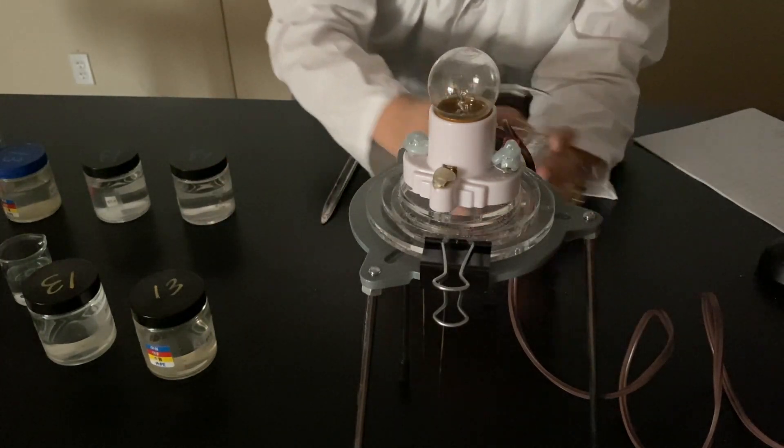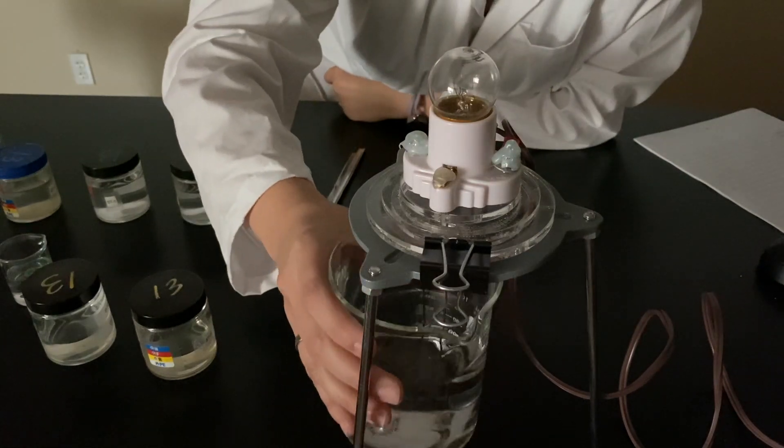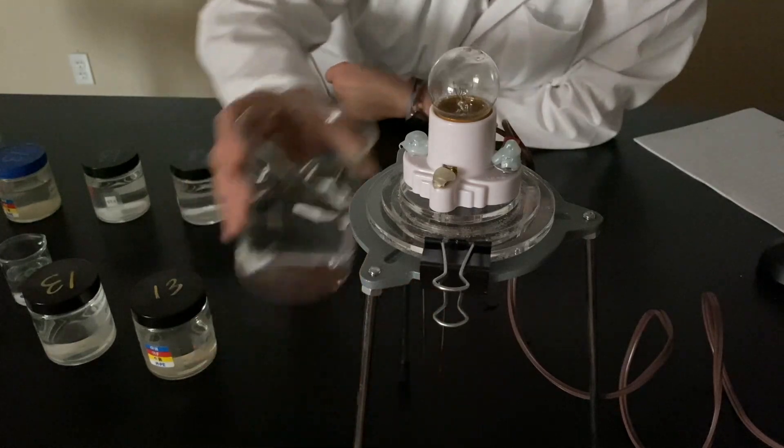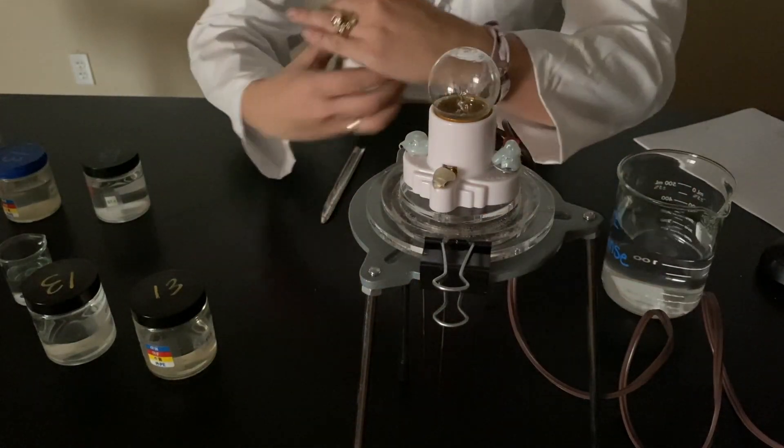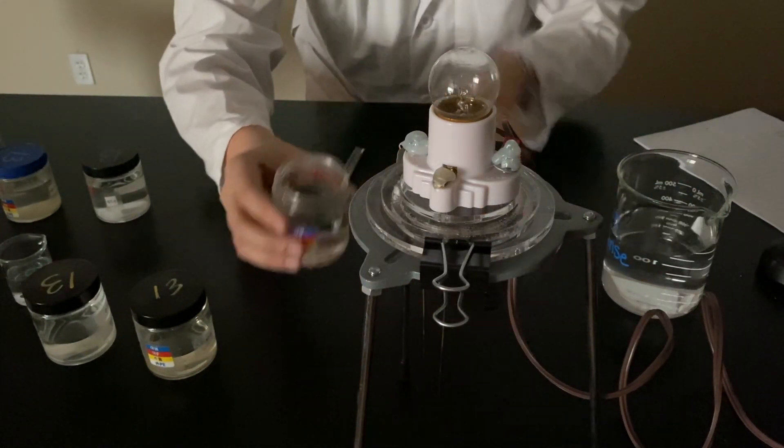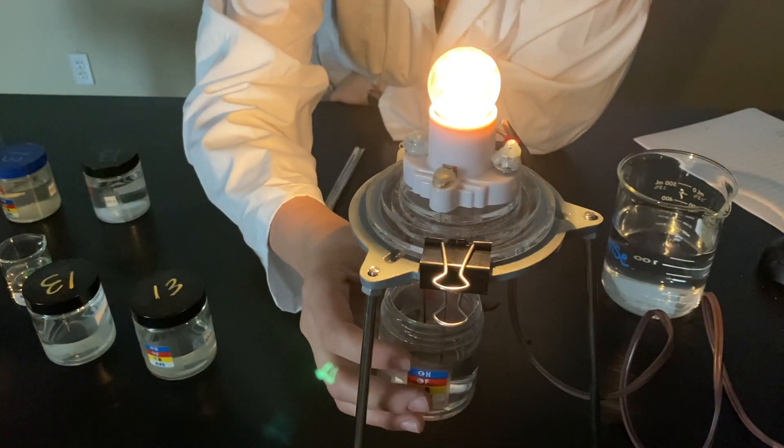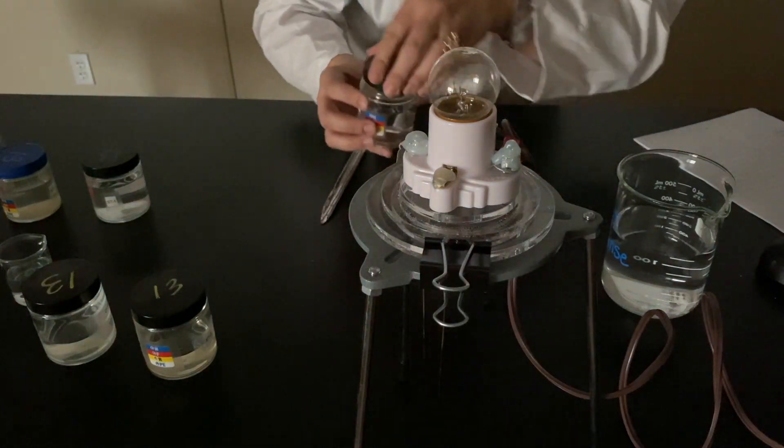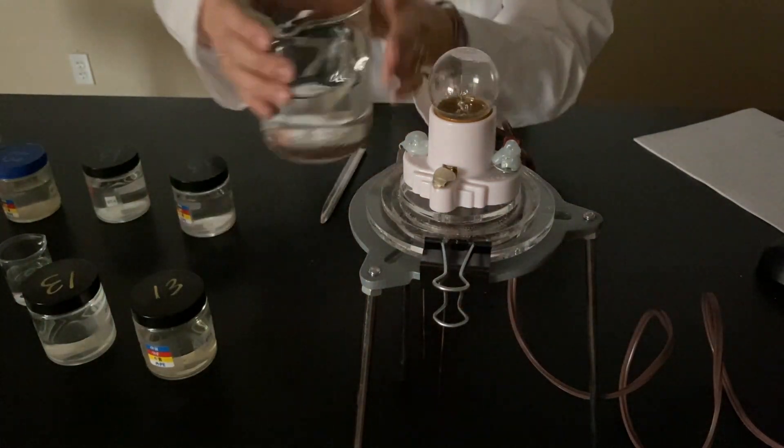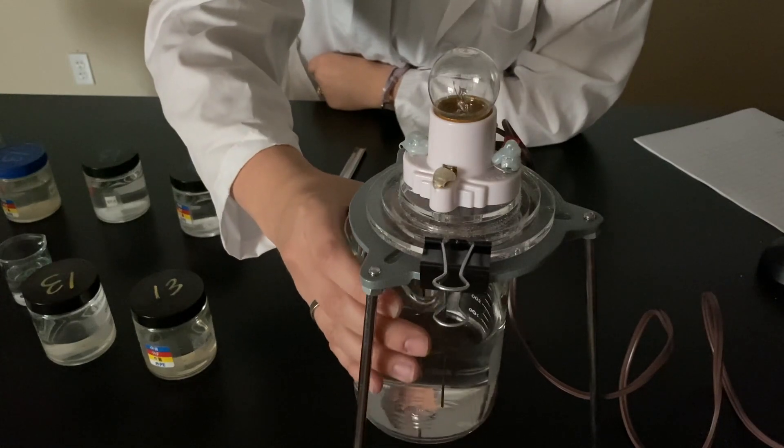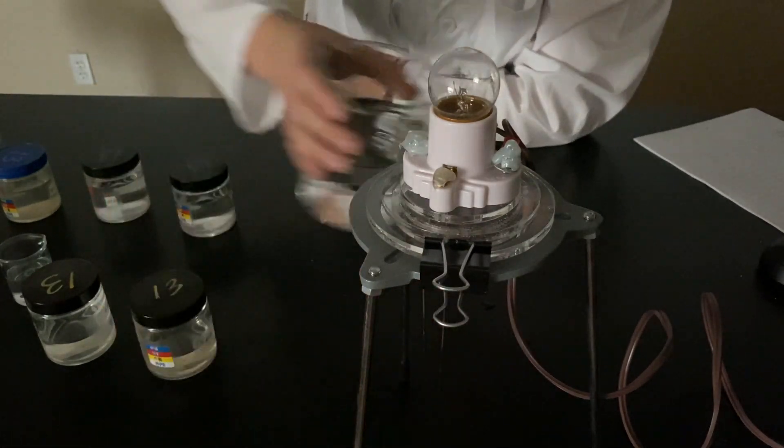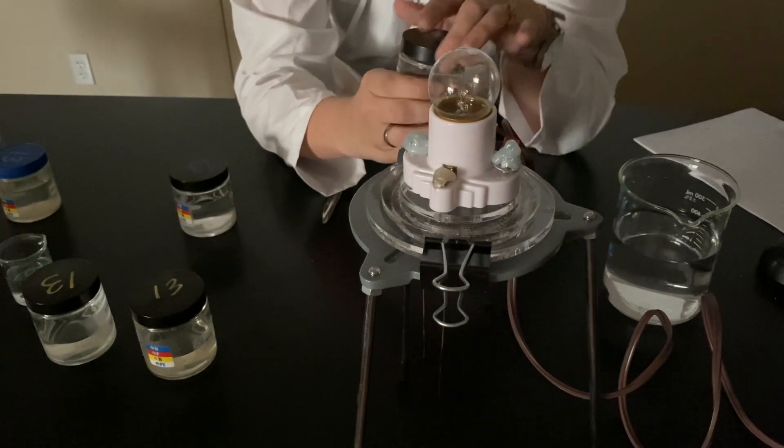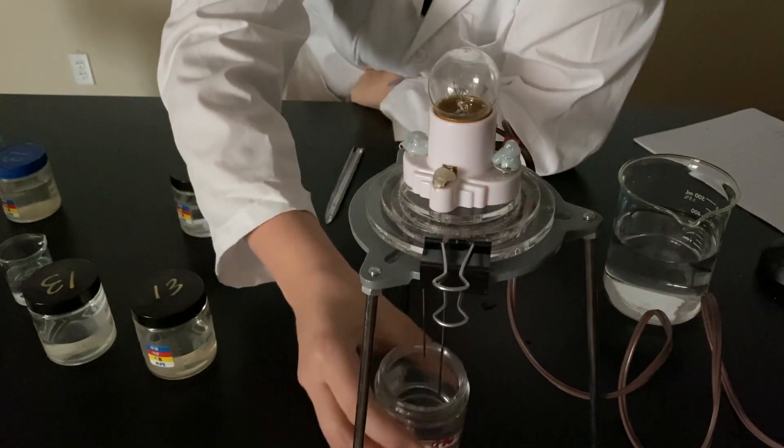What is next? 0.1 molar hydrochloric acid. But before I do that, I can't forget. Don't want to contaminate my experiment. So we'll do a DI rinse. There we go. 0.1 molar hydrochloric acid. And we rinse. And then, 0.1 molar nitric acid. HNO3.